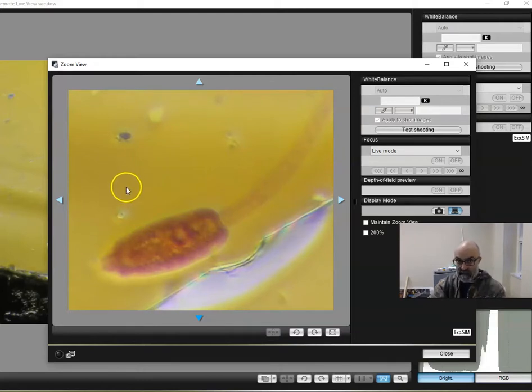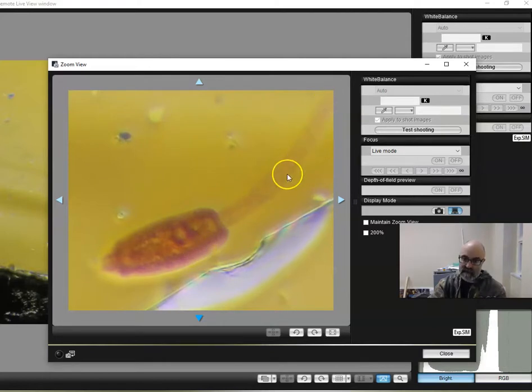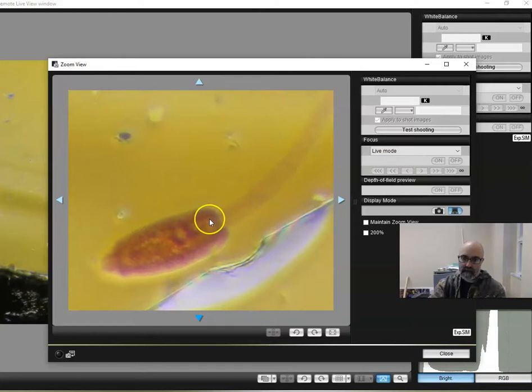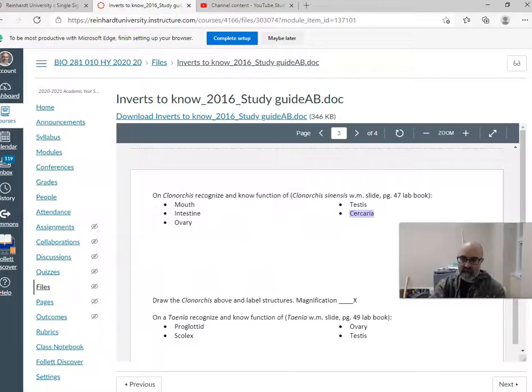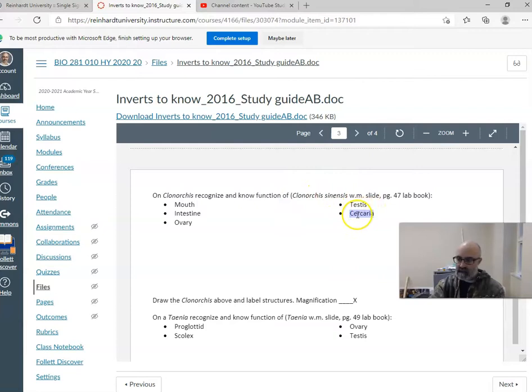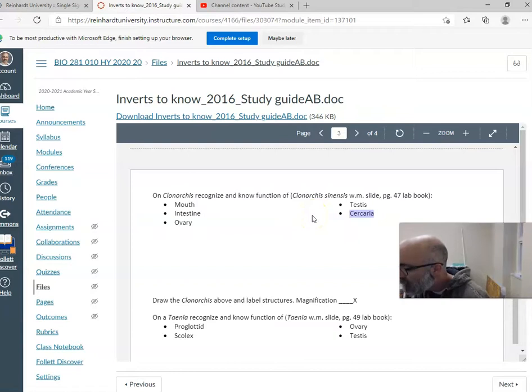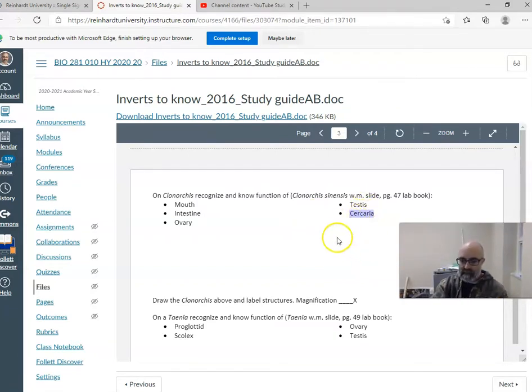This is the part of the life cycle that is dispersing from one parasitic host to the other. That's the cercaria. So don't look for that on the same slide. Look for that on a different slide. The slide is called Fasciola hepatica cercaria. Different species, but the same idea.